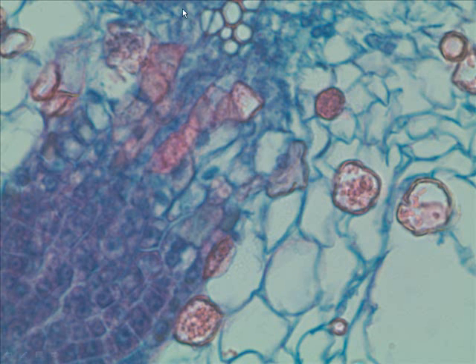We see the base of the branch root, and we absolutely are certain it's developing from what tissue layer? One more time, the pericycle. Okay, I think that's it, ladies and gentlemen.